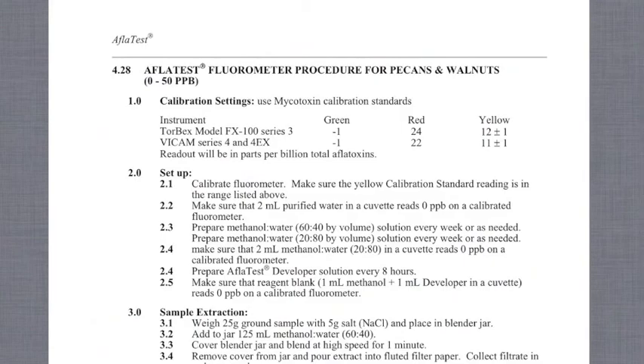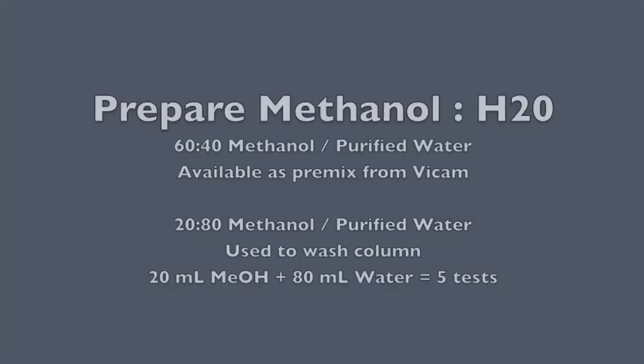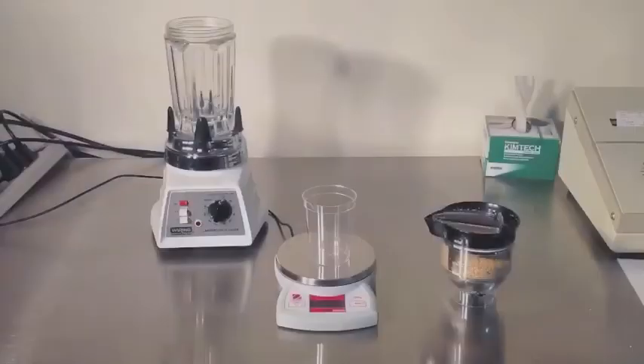Prepare your two methanol mixes. 60-40% methanol and water is used to dilute the samples. 20-80 methanol and water is used to wash the columns. You can purchase pre-mix solutions from Vicam or create your own with HPLC grade methanol.